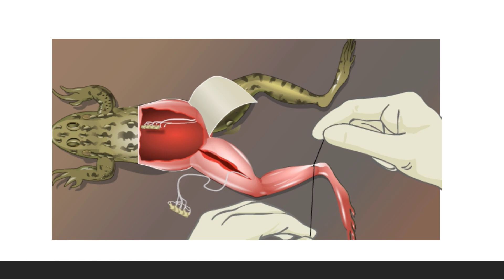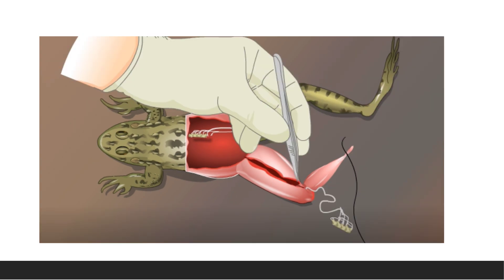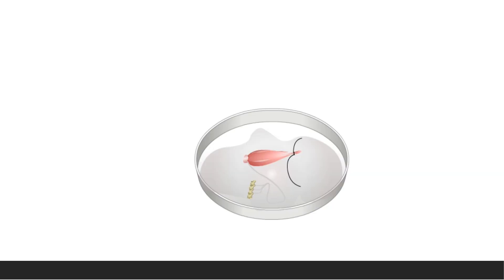When the gastrocnemius muscle skin is removed, tie one end of a long thread around the tendon of the gastrocnemius muscle, then separate the gastrocnemius tendon from its adjacent attachments. Next, cut the thigh and leg bones close to the knee joint and remove the redundant muscle.